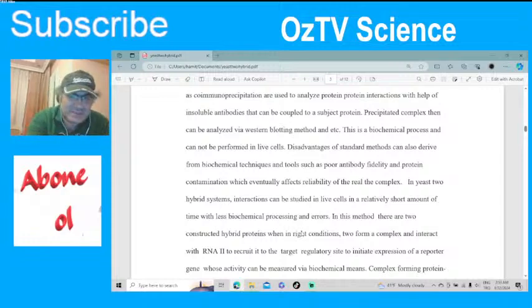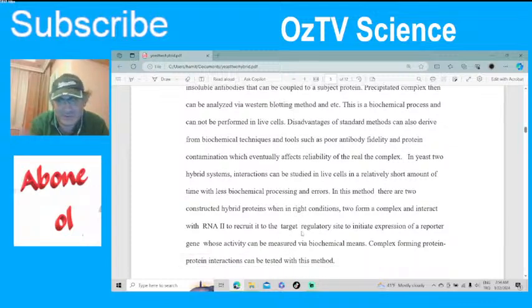So what are the disadvantages of the standard methods like these chemical methods? There are biochemical techniques like poor antibody fidelity. The tags sometimes don't work properly, and protein contamination just affects the reliability of the real complex. So in yeast two hybrid systems, this is a model. Like I said, a lot of people don't know this. This is called yeast two hybrid system, and it works.